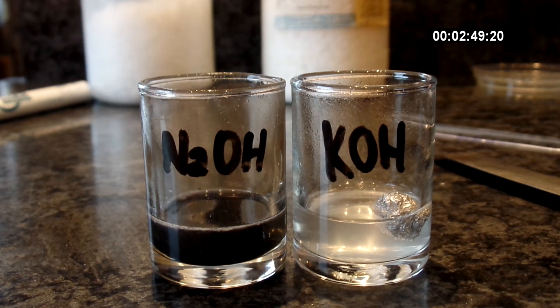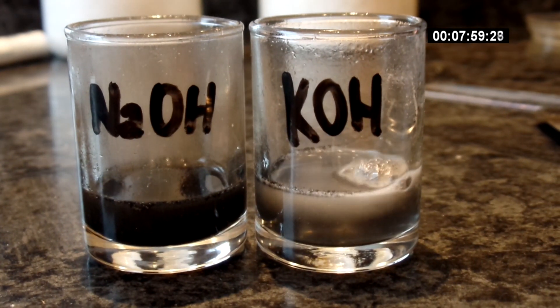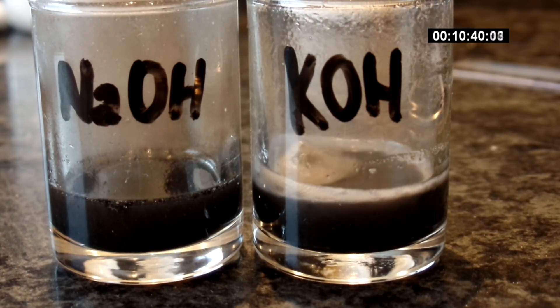This really surprised me. Sodium hydroxide dissolved aluminum really fast — as expected — but potassium hydroxide is doing so poorly. Sodium hydroxide clearly won this round.